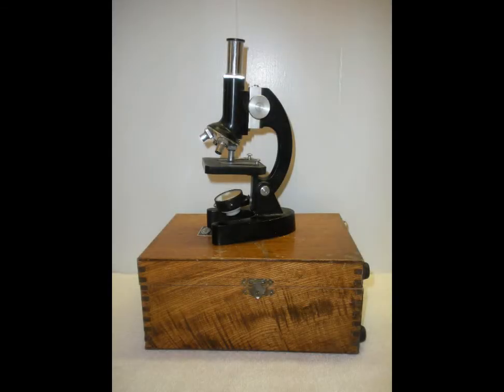I love microscopes. In fact, I've loved them my entire life — well, just about my entire life, at least for the past 60 years.